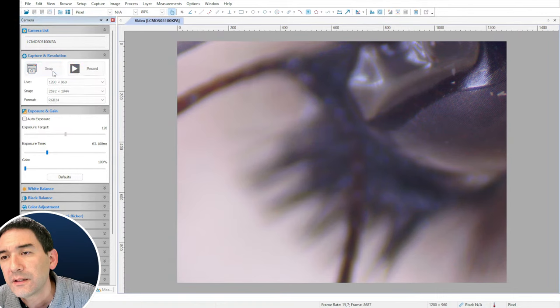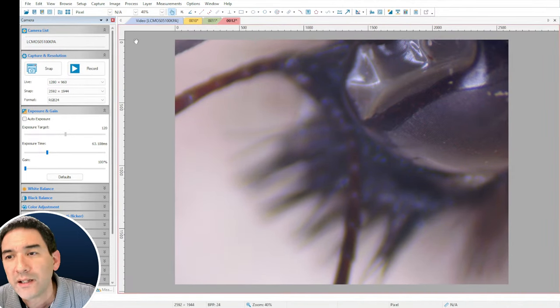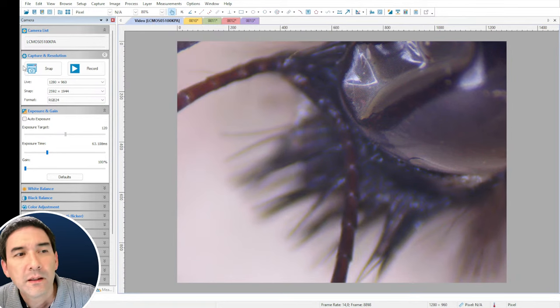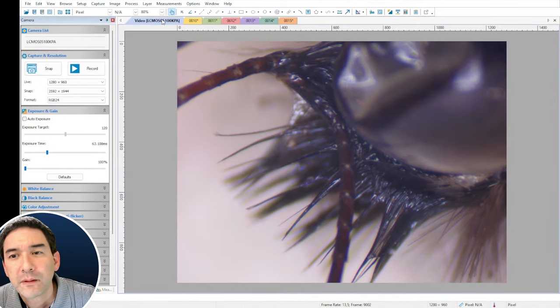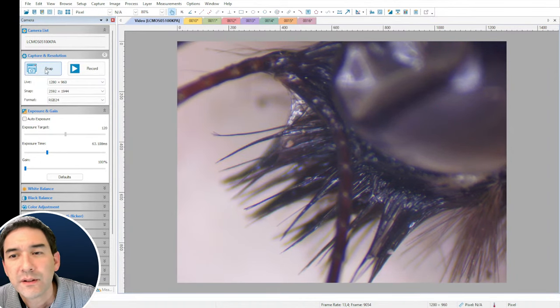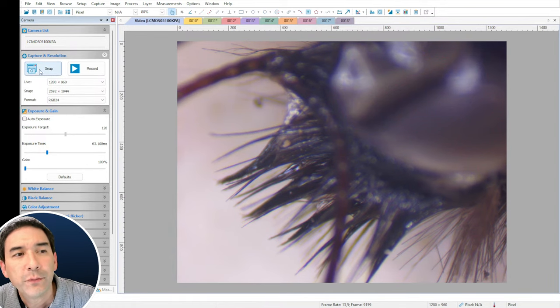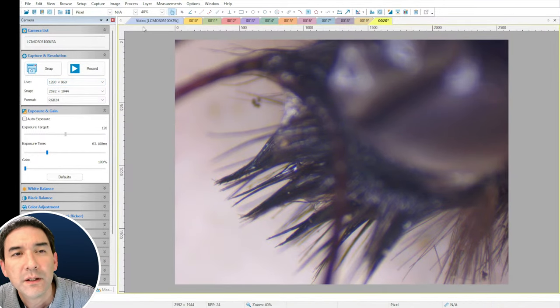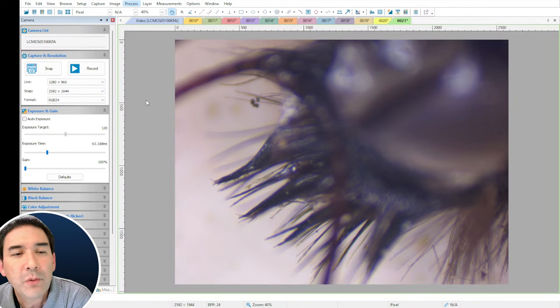I'm going to take another series of pictures: snap, focus down, snap, focus down, snap — repeating the process. By the way, if you're interested in trying TubeView, it can also be downloaded for free. So let's try it — and look, this program also has image stacking built in under the Process menu.